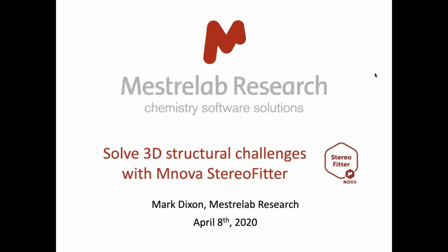We're very excited to introduce to you a groundbreaking piece of software that we hope you will want to try for yourselves. Now, by way of introduction, I'm an organic chemist by training who found his way into the world of NMR spectroscopy at a relatively young age and has stuck around ever since. So I know next to nothing about the mathematics of molecular modeling or structural dynamics, etc. However, I do appreciate the importance of having a deeper understanding of how a molecule hangs in three-dimensional space, or in the case of a drug candidate in a pharma environment, which conformation it prefers in aqueous solution.